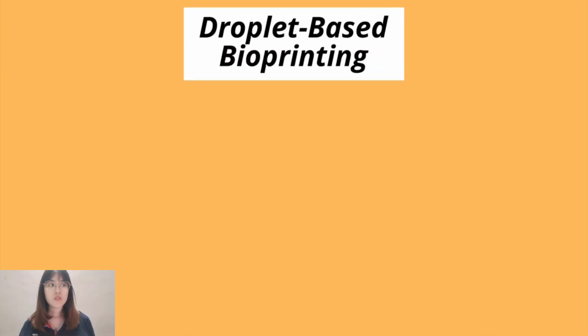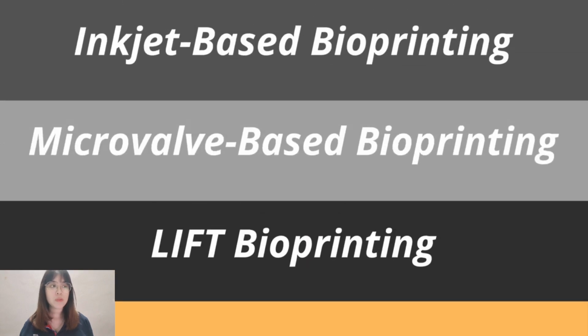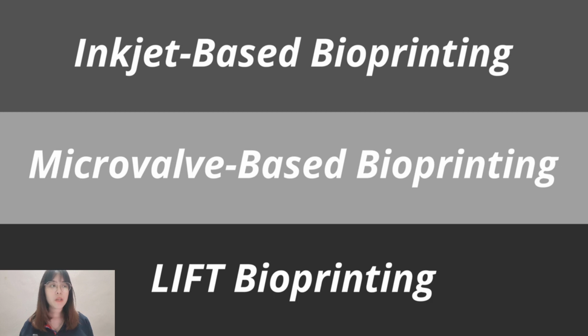In contrast, droplet-based bioprinting deposits discrete volumes or droplets of bioink onto a surface. Droplet-based bioprinting methods include inkjet bioprinting, microvalve-based bioprinting, and laser-induced forward transfer bioprinting. As with extrusion-based bioprinting, the bioink must be quickly stabilized in order for the structure to retain its shape, and the exact manner in which this is accomplished depends on the hydrogel being used.